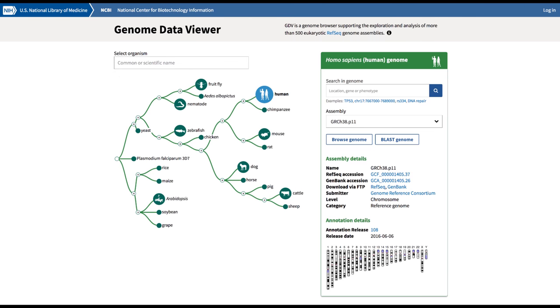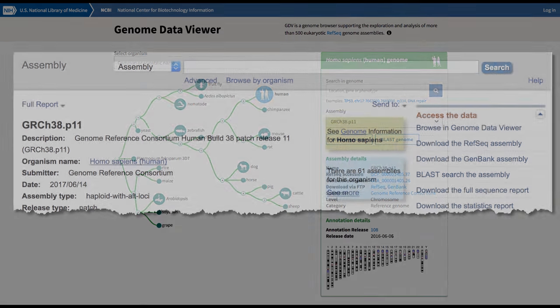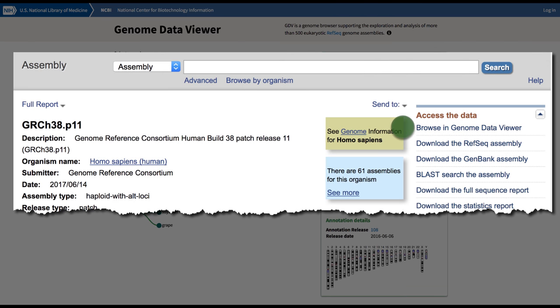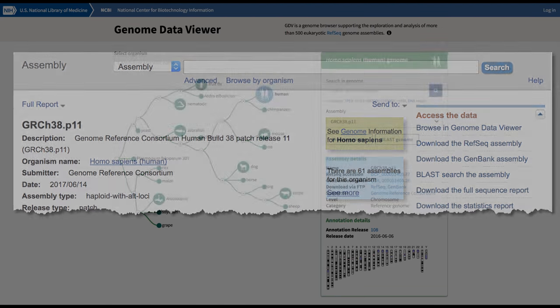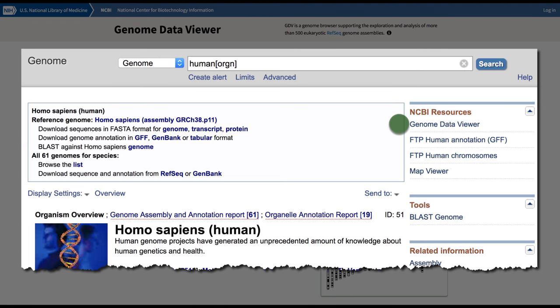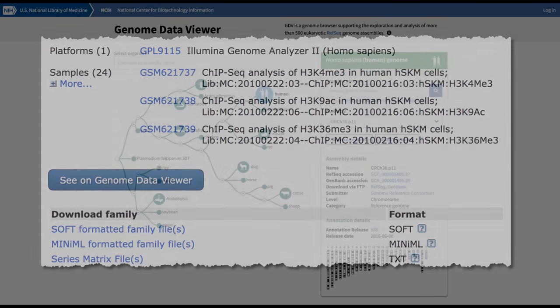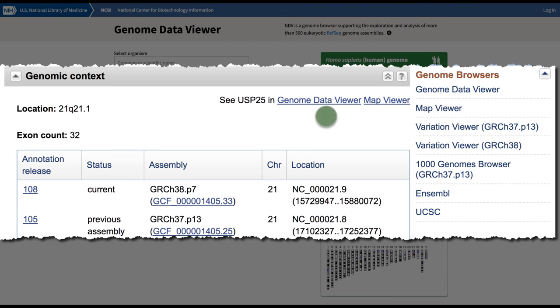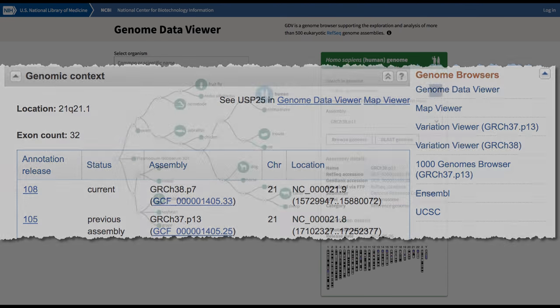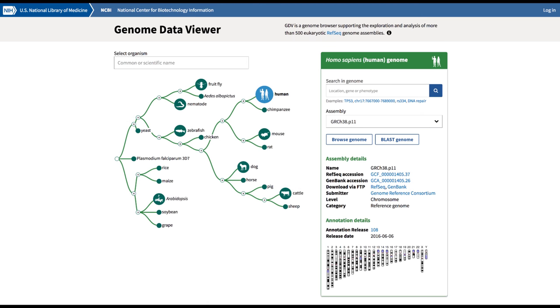That was just a sampling of the genome data viewer's capabilities. Look for links to the GDV on many NCBI record pages, including Assembly, Genome, Geo, Gene, and coming soon to BLAST.